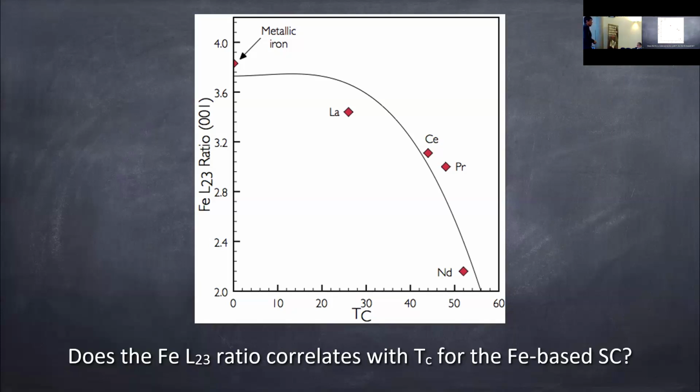Yeah, this was measured at room temperature. In the electron microscope at the time, we could measure any temperature as long as it was room temperature, plus or minus 2 degrees Celsius, depending upon how you set the temperature of the room. And I'm not making this up. My electron microscope in Seattle is at 28 degrees Celsius, because the air conditioning is not able to handle the temperature stability. So I turn off the air conditioning altogether and let it come to thermal equilibrium. The microscope room gets heated up because of the electronics, and my microscope is a little bit warmer than the other microscopes. So my room temperature is 28 degrees Celsius.